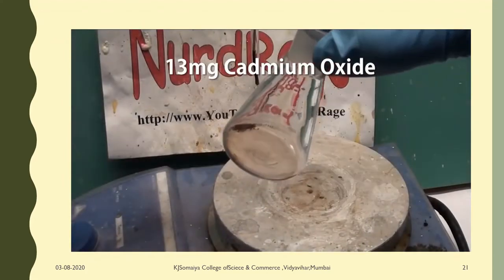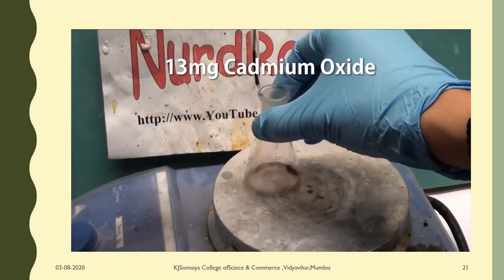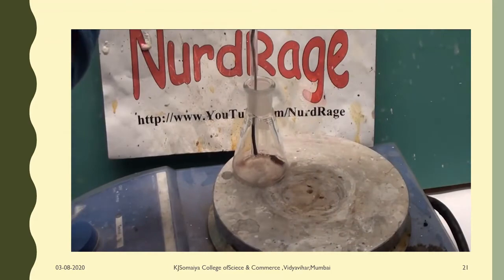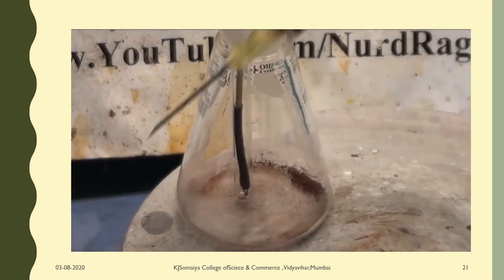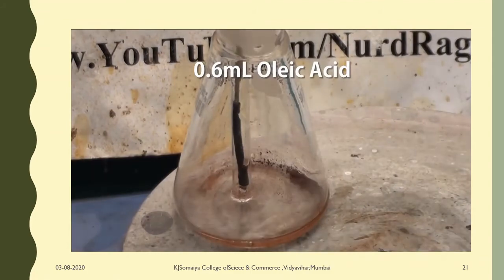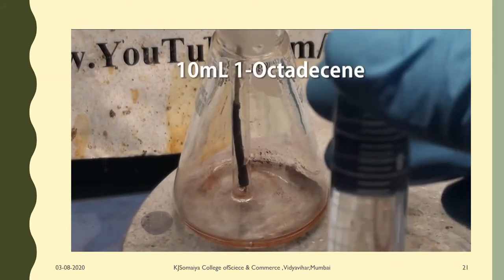Now get 13mg of cadmium oxide in a flask and place in a glass thermometer. Mine happens to be a glass encapsulated digital thermometer. Now add to it 0.6mL of oleic acid and 10mL of 1-octadecene.